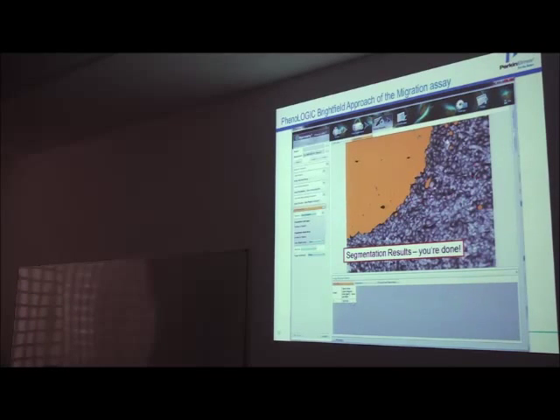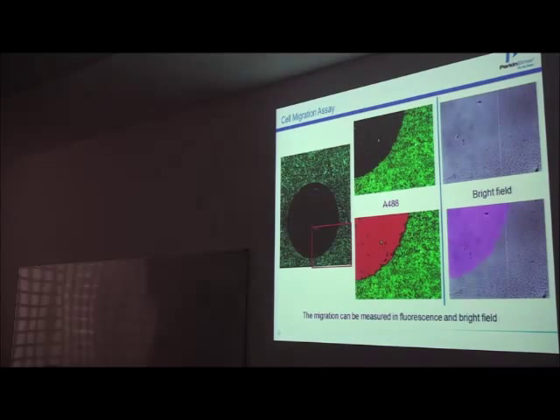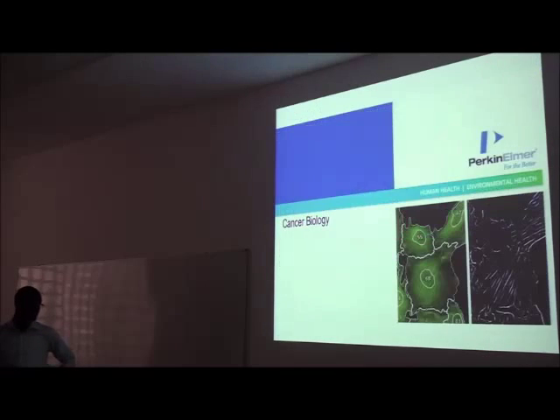And I just put the intensity image in the back so that you can see it very easily. Right. And there is a very good correlation between intensity and fluorescence and brightness. And that was recognized that this is really valid and very easy analysis in 3 steps.